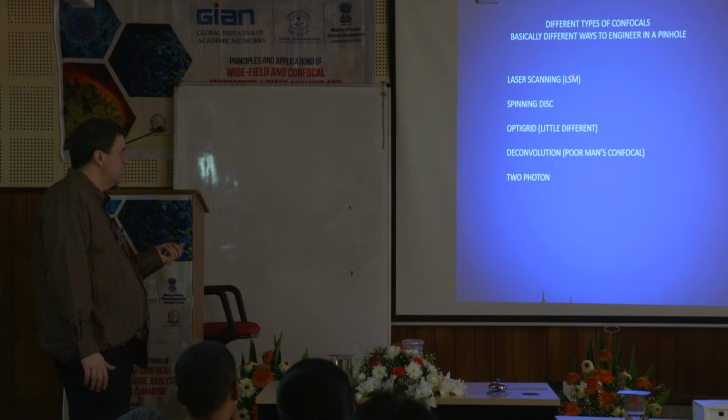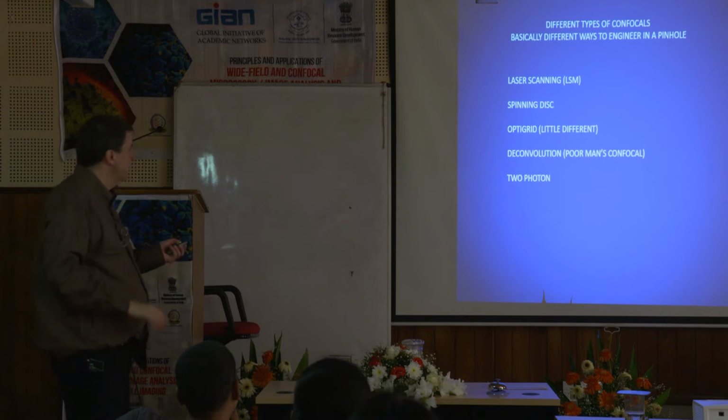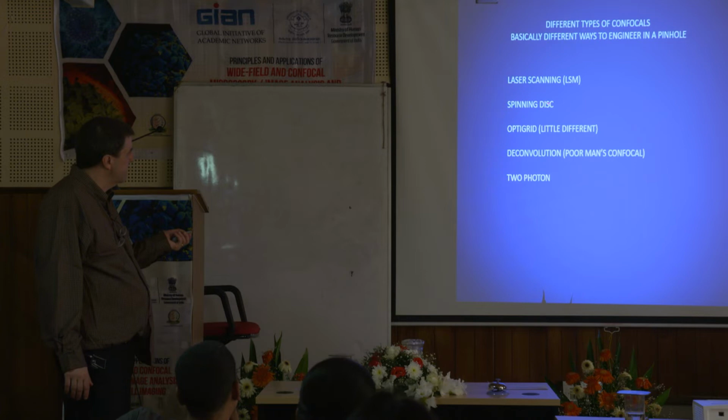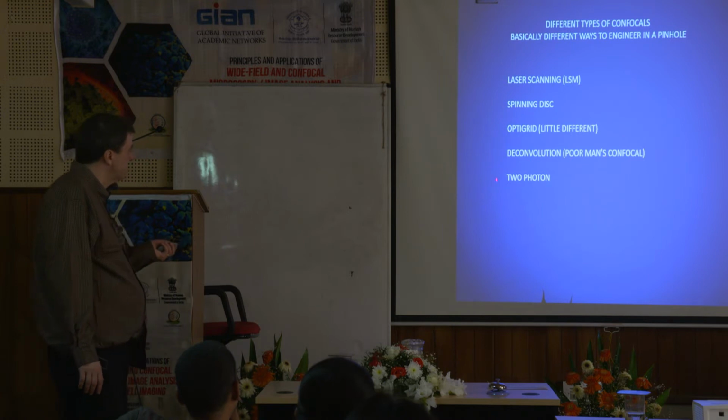Okay, and as you saw it yesterday, if you were in group 1, you got to see it goes bzz, bzz, bzz, bzz, okay. There's another one called spinning disk. We're going to be talking about these now. There's one called Optigrid Deconvolution we touched on yesterday. Poor man's confocal using a wide field microscope, and then we're going to talk about 2-photon confocal.